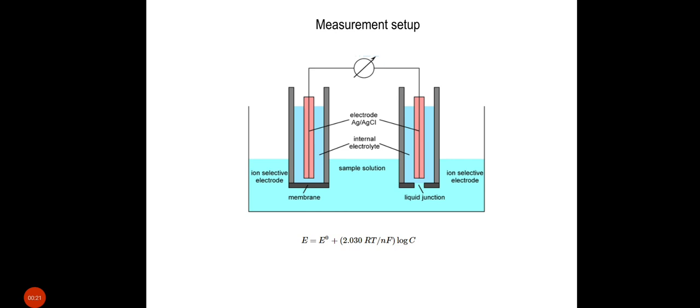There are commonly more than one type of ions present in the analyte or solution. So how does the ion selective electrode manage to measure the concentration of a certain ion in solution without being affected by other ions? This problem is solved by applying a selective membrane at the ion selective electrode, which only allows the desired ion to go in and out.